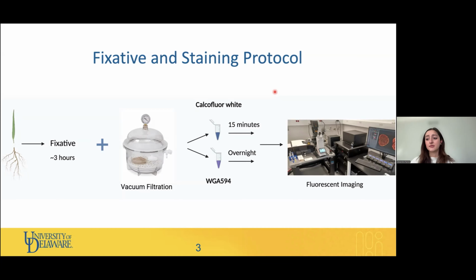Once that process was complete, the samples were stained. We stained them with calcofluor white, and that was for binding to the cell walls of the plants for imaging. Then the plants were immersed in wheat germ agglutinin 594, and that was for staining the cell surface glycoproteins to tag Streptomyces coelicolor for fluorescent microscopy imaging.